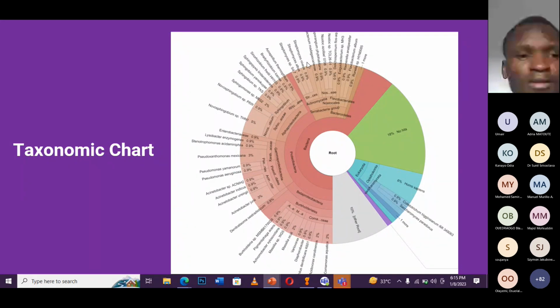Excuse me, one minute, please. Can we get this from the metagenome or whole genome? No, metagenome, not whole genome. Whole genome is just one organism. If you do this kind of analysis for a whole genome, you only have one name of an organism.